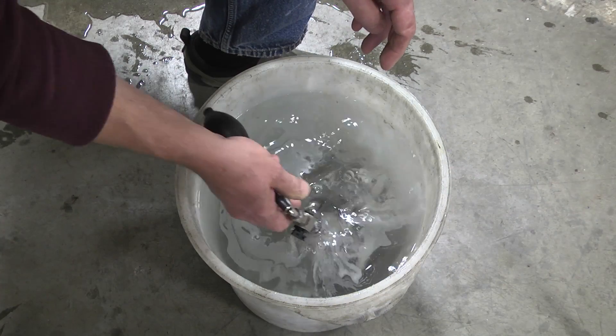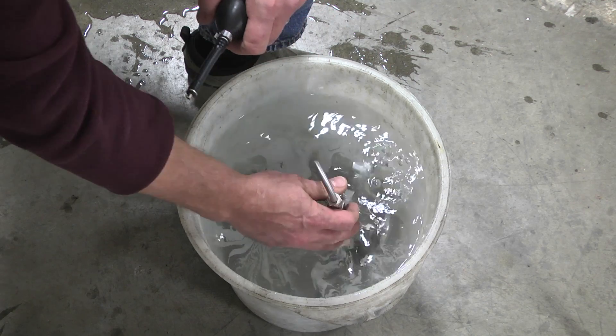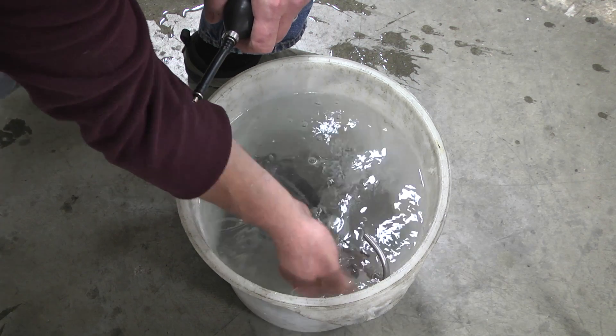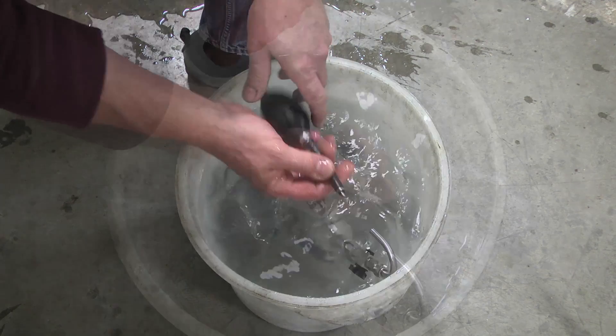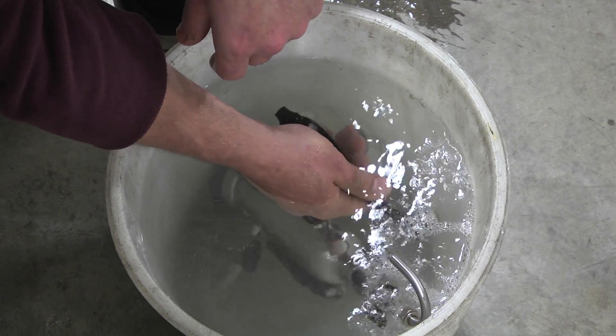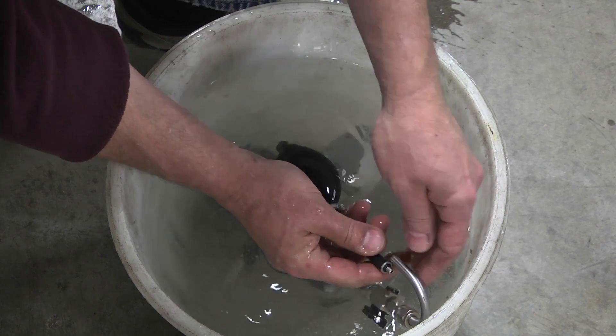Rinse the inside of the volume meter with water to remove any traces of beer. Do not use hot water as it will damage the thermometer. Make sure to rinse out any traces of beer from the aspirator bulb to prevent the check valve from sticking.